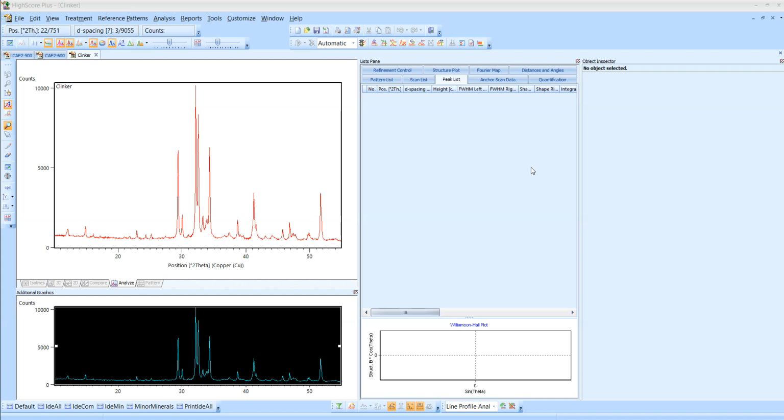In this video we want to talk about how we can plot an XRD pattern in Origin software. Why is this video useful for you? Because learning this type of method helps you plot your XRD pattern or your analysis results in your article or in your scientific reports.